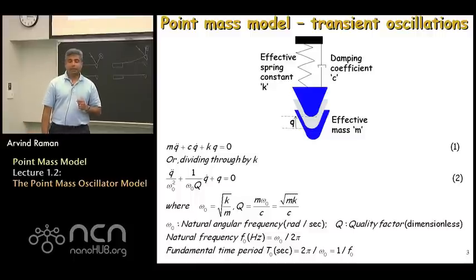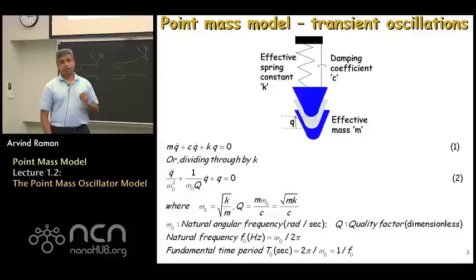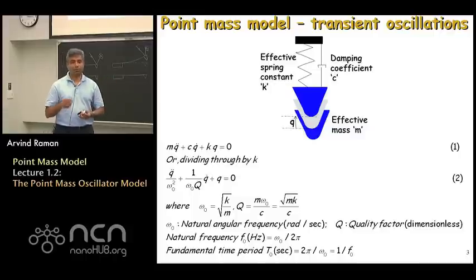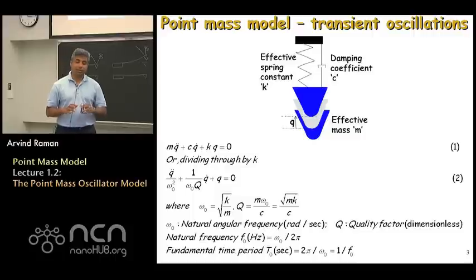We are going to begin today's lecture by talking about the transient oscillations of the probe. Our eventual goal, of course, is to get from transient oscillations to understanding the response of the probe in the presence of tip-sample interaction forces, in the presence of excitation forces as well. But for the moment, let us remove all external forces and just try to understand what happens to the dynamics of the probe just as is.